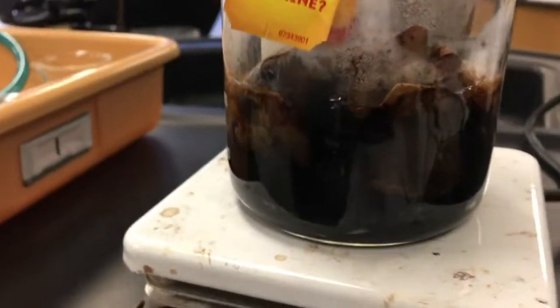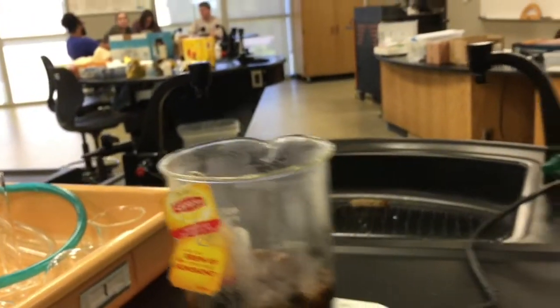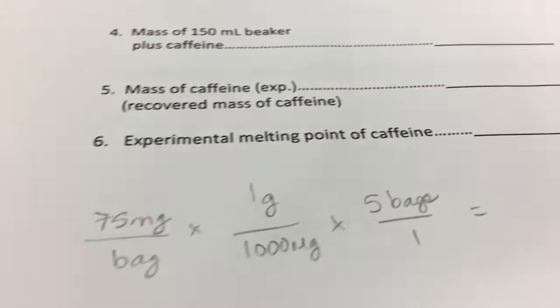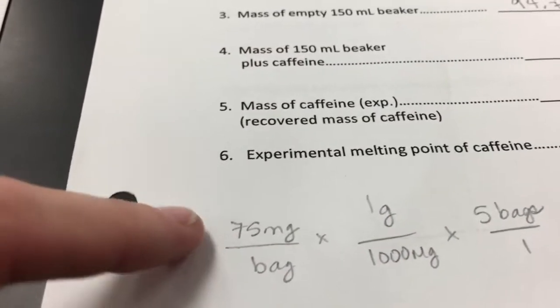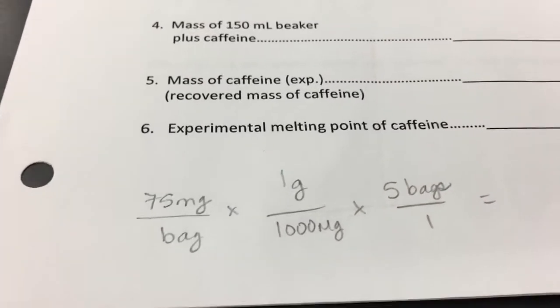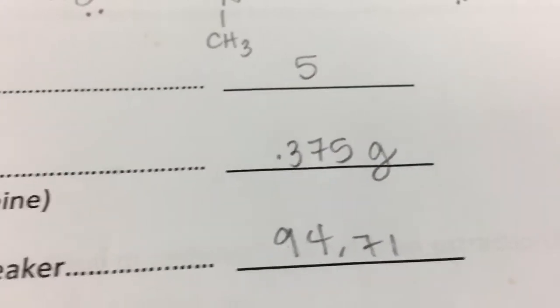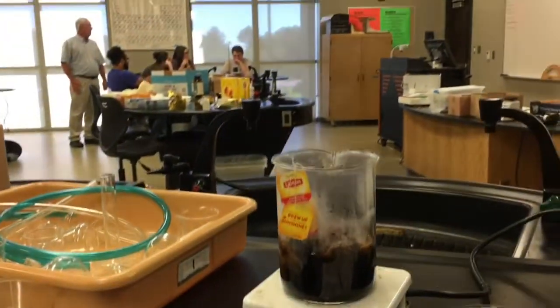We now have our five tea bags boiling. We also deduced that each Lipton tea bag has an approximate 75 milligrams of caffeine, and so five bags would equal roughly 0.375 grams of caffeine. I'm not going to get too aggressive on trying to get all the tea, y'all.